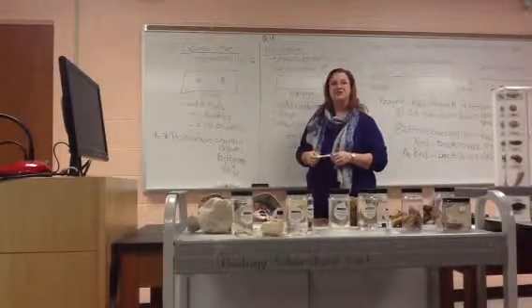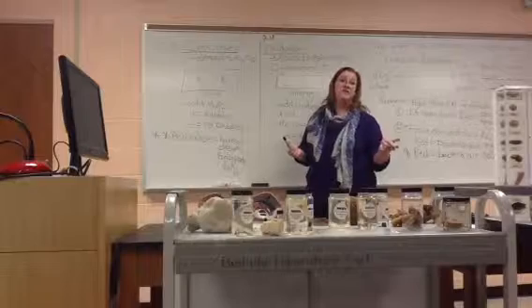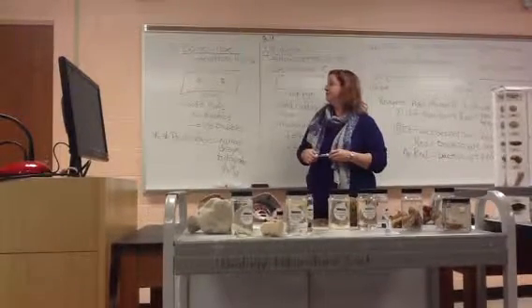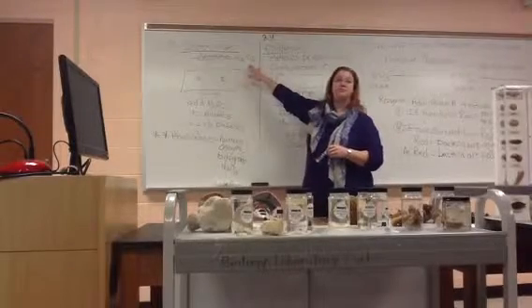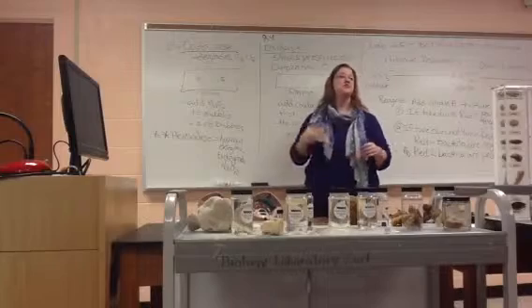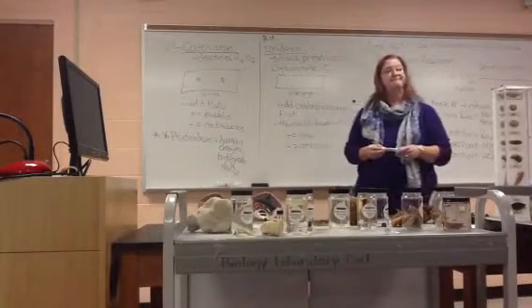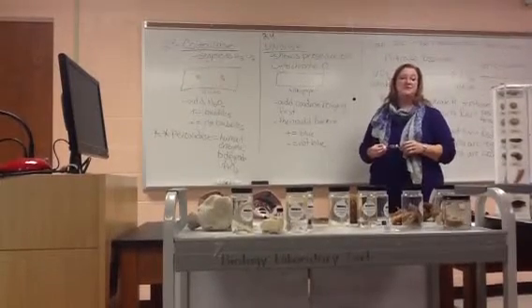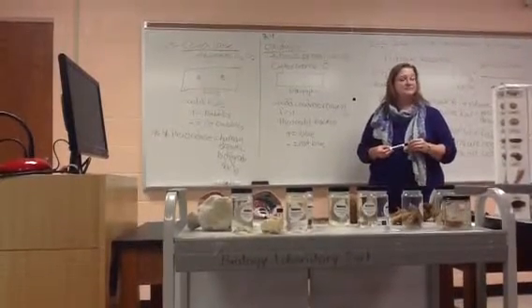Technically for this test, yeah. It's the only way you're going to know if they make catalase or not. What was the positive you had catalase means? Can degrade peroxide. Yeah. Positive looks like bubbles, positive means produces catalase. Negative looks like no bubbles, negative means does not produce catalase.